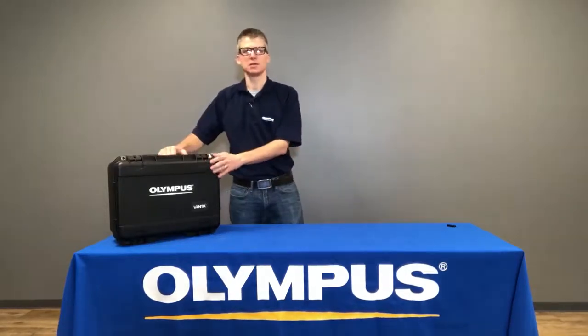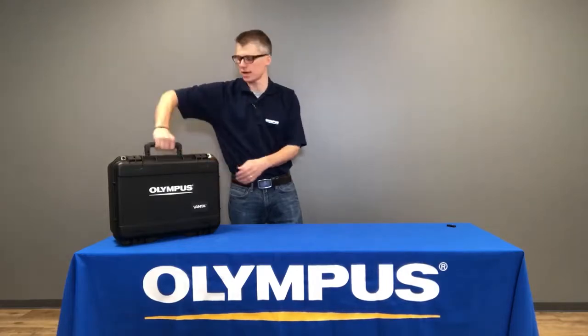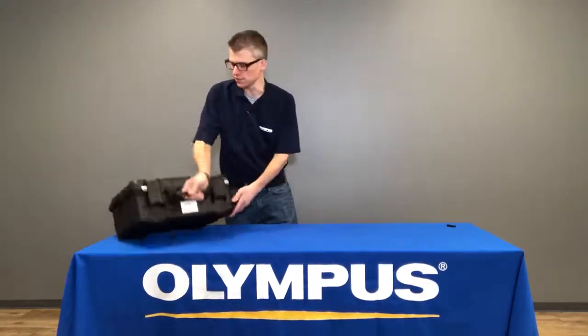The Vanta comes in these hardened ruggedized cases, which is great for shipping the Vanta around or carrying the Vanta out to the field site.